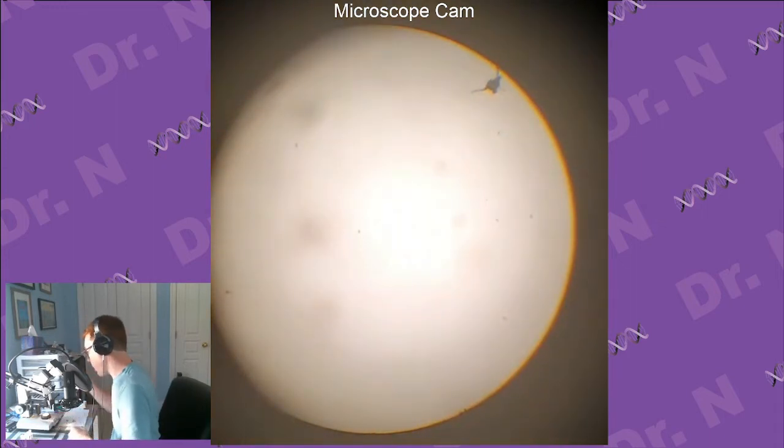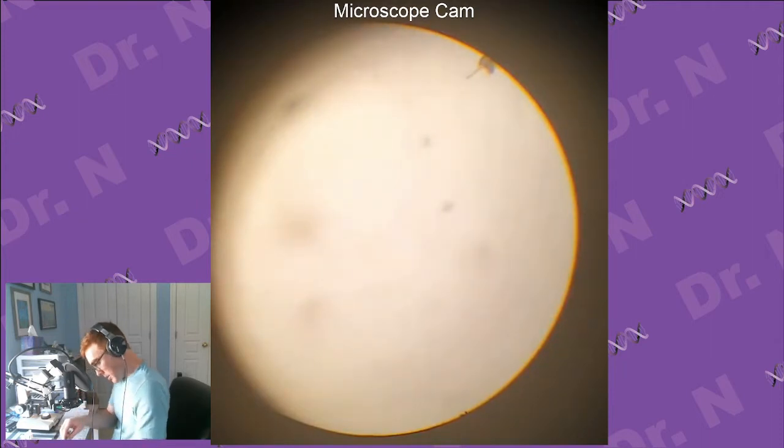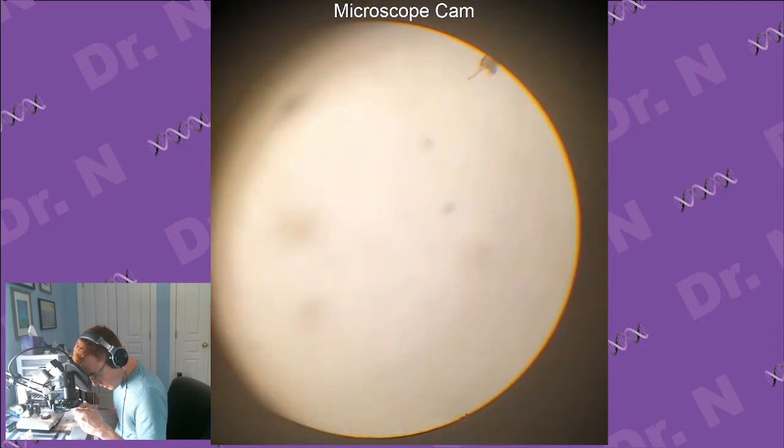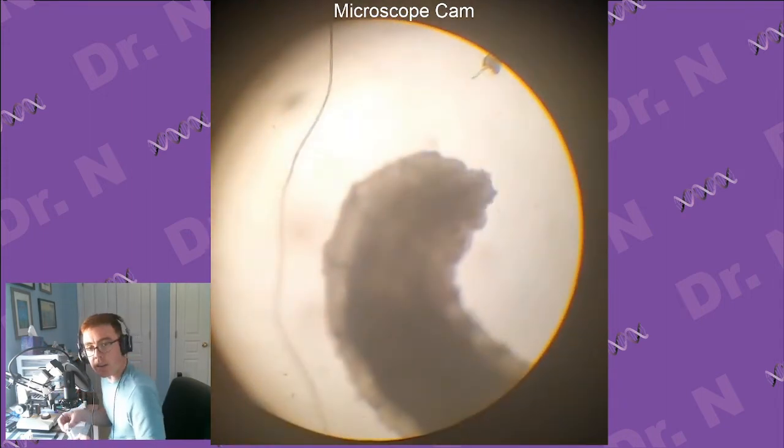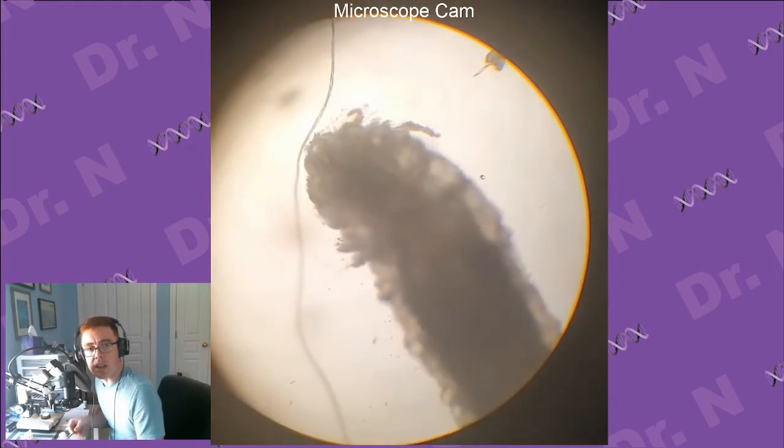All right, so this will also need a little bit of liquid. I just have some PBS buffer, just to kind of keep it wet. If I don't work fast, it's probably going to try and crawl away, but that's okay. There we go. So this one should have an obvious difference. So it's actually alive.